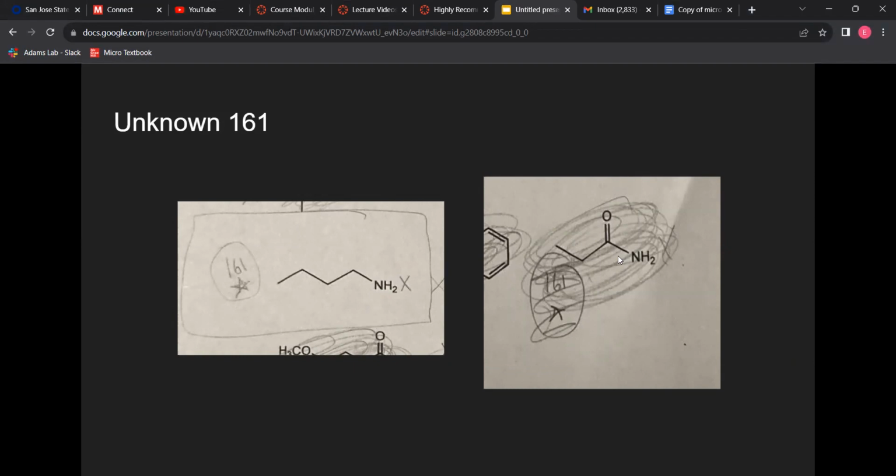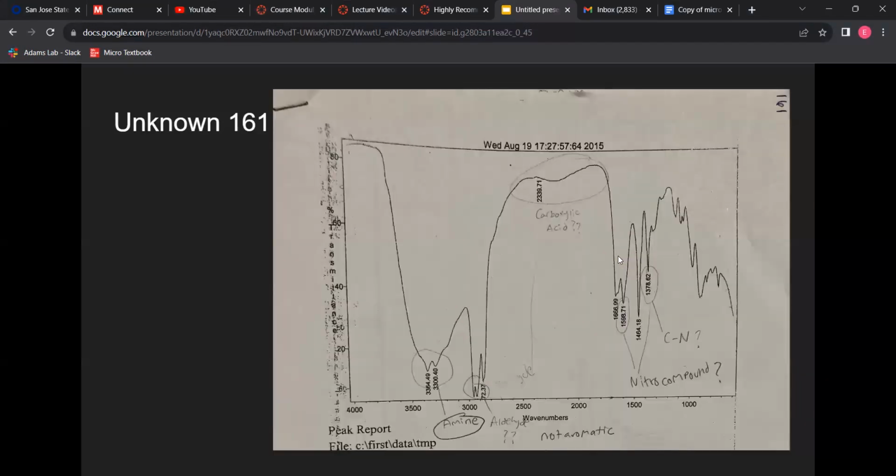I decided to go and check for the oxygen double bond, and the only possible carbon to oxygen double bond peak would have been the one at 1666. However, the only thing that corresponds to that would have been an amide. However, an amide requires peaks at 3180 to 3300, 1000 to 1350, and 1640 to 1700, which not all of that is present here.